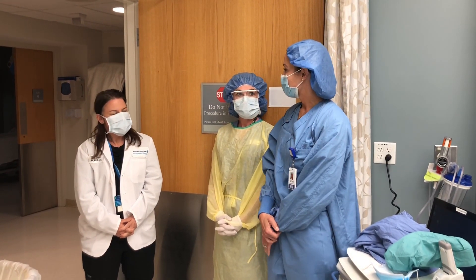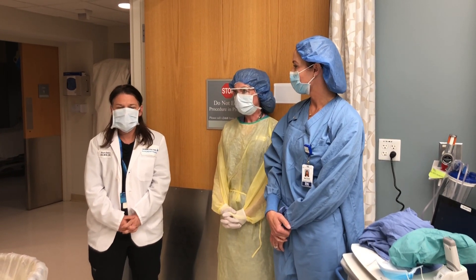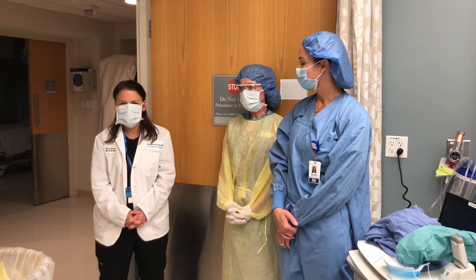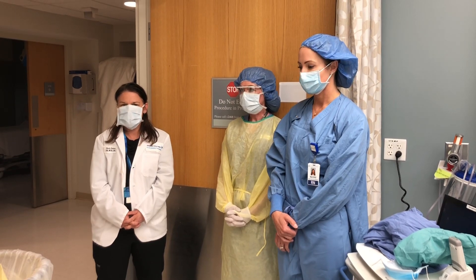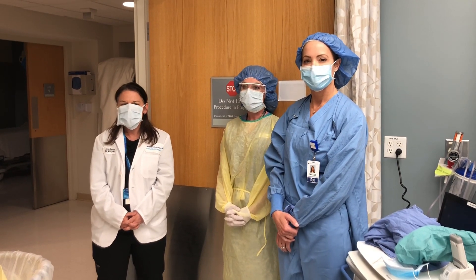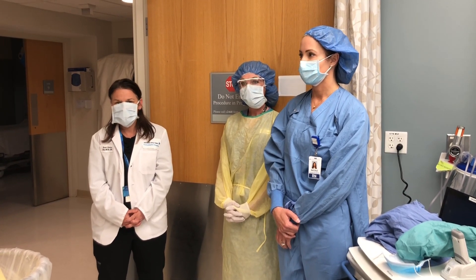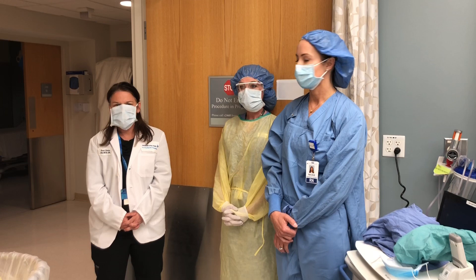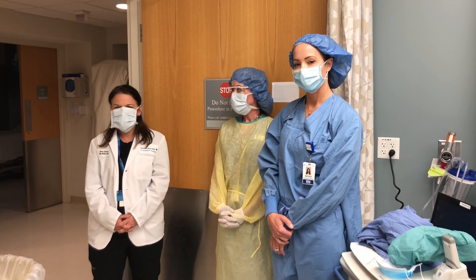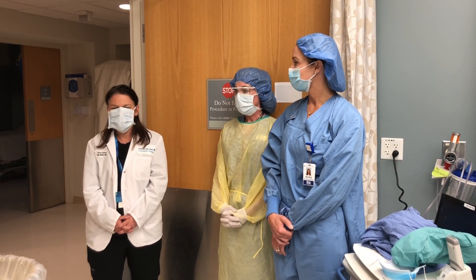Now we're going to be performing doffing. We are showing the doffing of personal protective equipment when leaving a patient care area or a patient care room. There is a typical procedure for this, but during these difficult times and following the CDC recommendations and our recommendations from BILH, we have really evolved the extended wear of our PPE guidelines along with our conservation of PPE guidelines. So what we're going to show you now is really the doffing of the personal protective equipment with some opportunity for extended wear of the surgical mask.